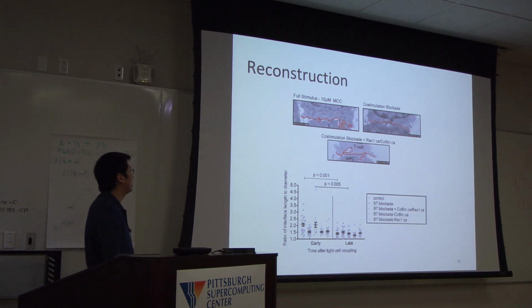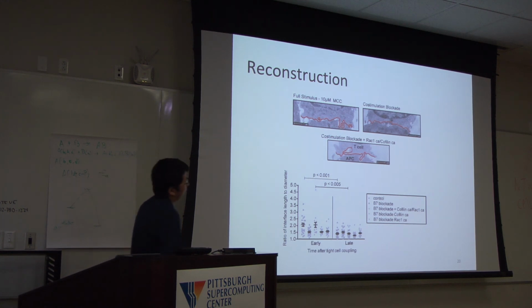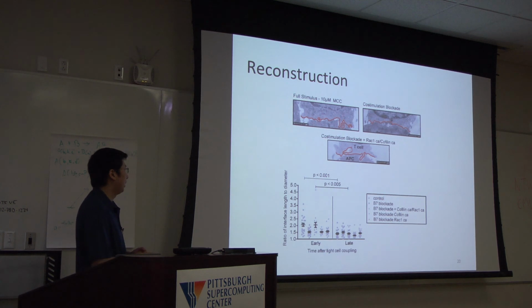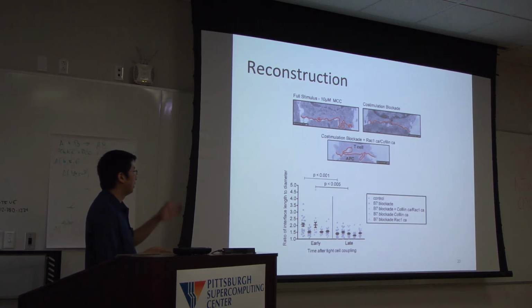Here we measure the length of the synapse to indicate the formation of synapse, and we found the selective activation can restore the formation of synapse.